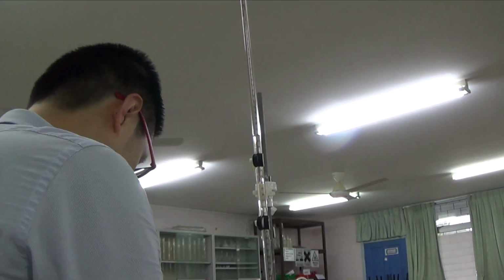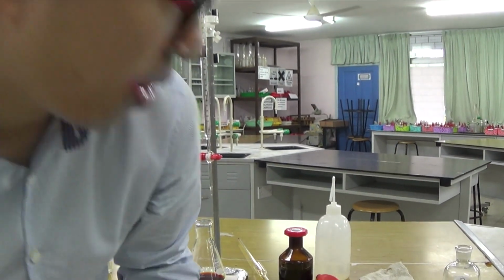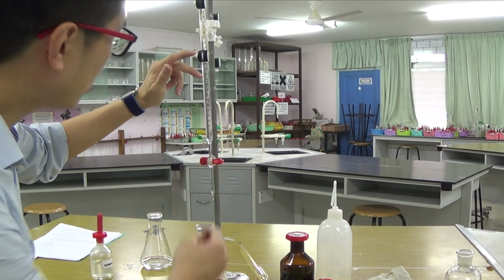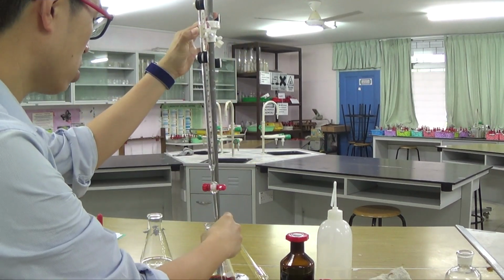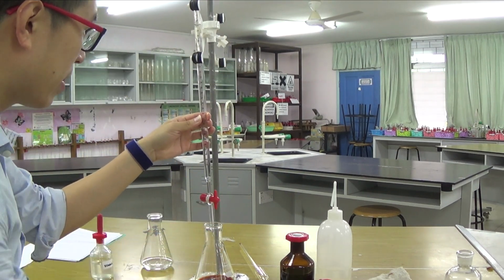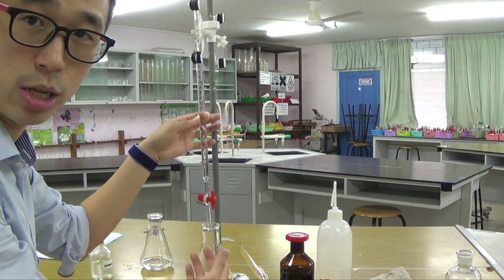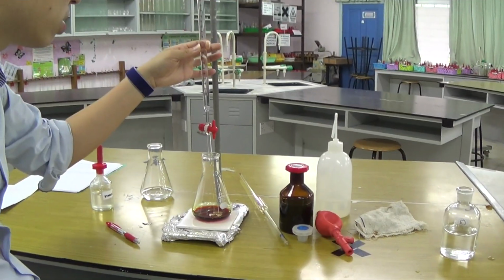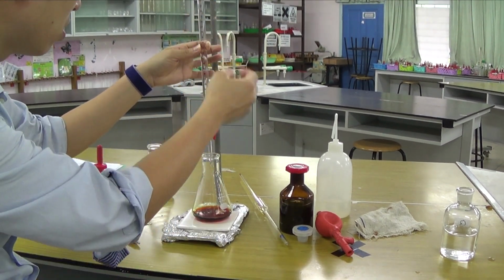Okay, so let's get started. So 42.3 would be my rough endpoint. So 40 is where I'll slow down and do it drop by drop. So 40 is around there. But I might want to add my indicator when it changes brown. I don't really need to swirl that much at this point because I'll just be wasting my energy. So I just need to let it flow.